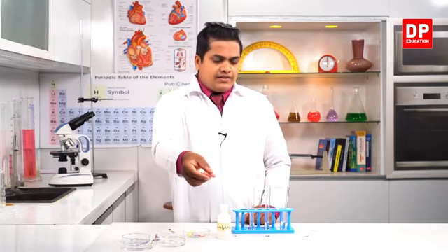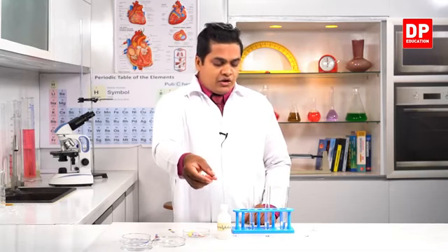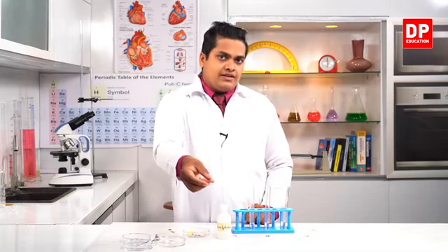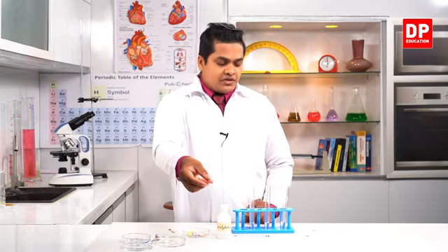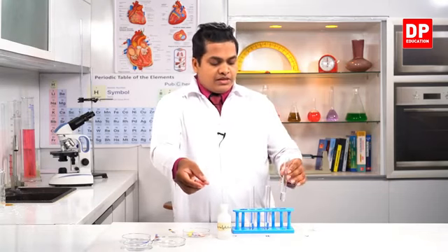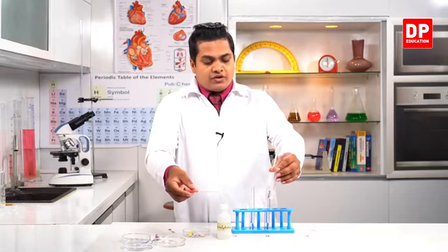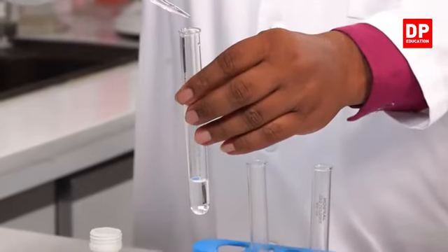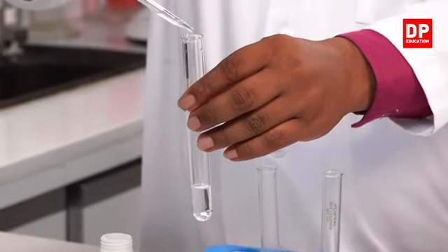Now let's add a drop of phenolphthalein to each of these vessels and let's see whether we can get this observation. So first of all, I am going to use the leftover part of this hydrochloric acid solution and I am going to add a drop of phenolphthalein.